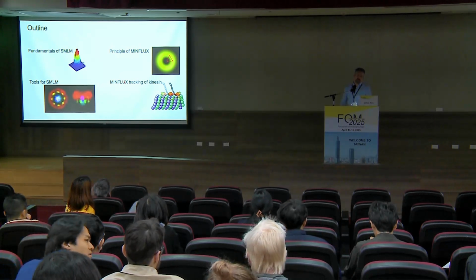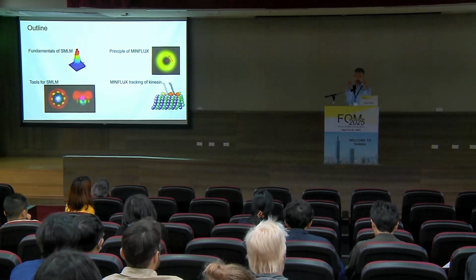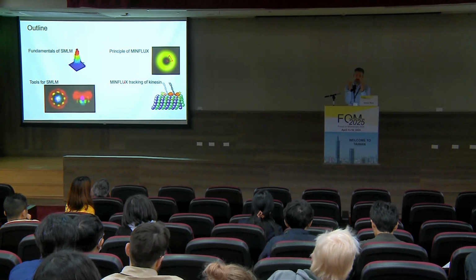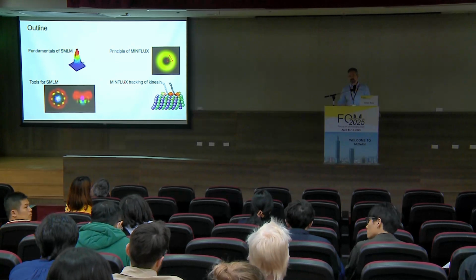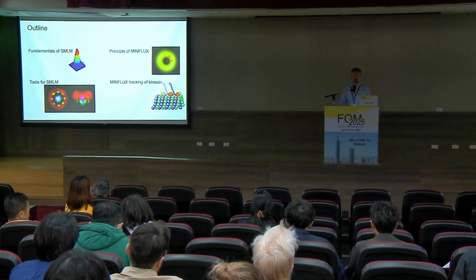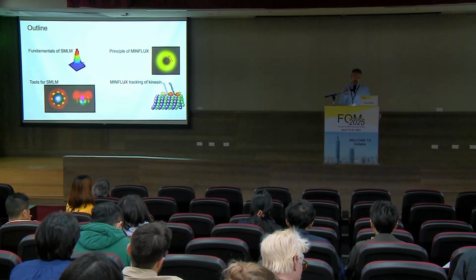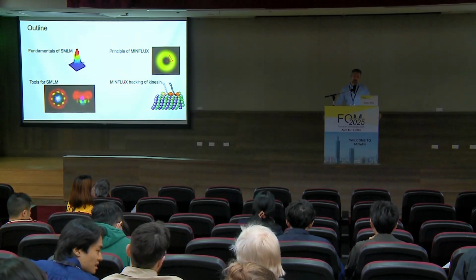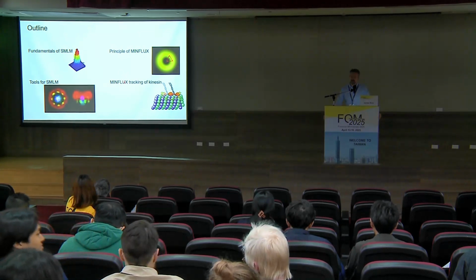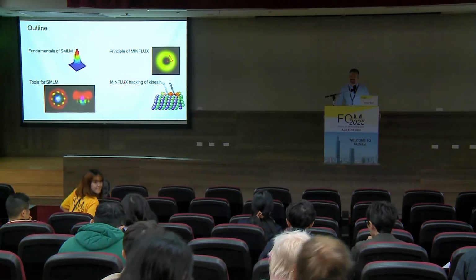The problem is if you have blinking probes like DNA-PAINT or STORM probes, then it's very unlikely that both of the two labels on our target proteins are on at the same time. So either one or the other is on, and so we could not really look at the dynamics. Don't blink them, just bind them and have them bound there. Sure, I think this is one way. It's not easy, I think, to do this inside the living cell because the imaging strands, or also the labels, don't really go into the cell. So one probably can do this on the cell surface. And I think live DNA-PAINT has been done on cell surface proteins, and then there's no reason why not to track them. That's a good point.